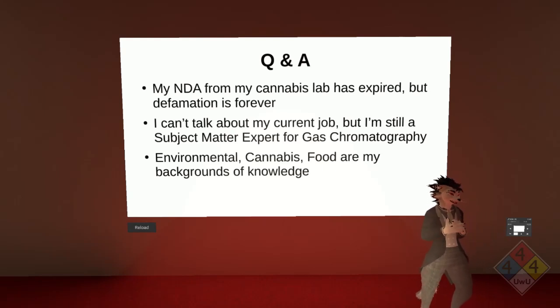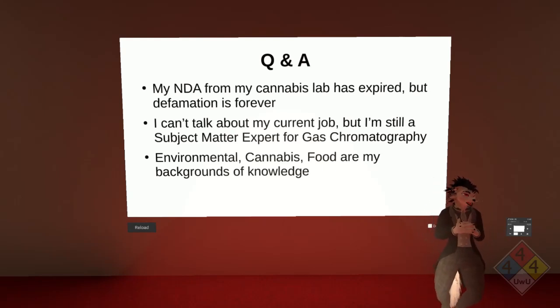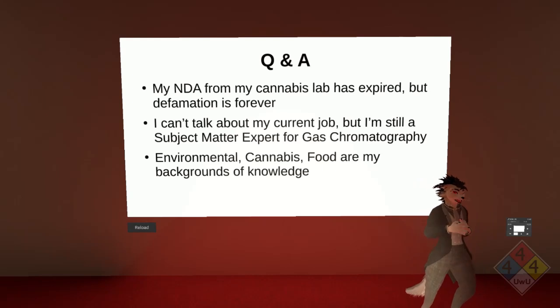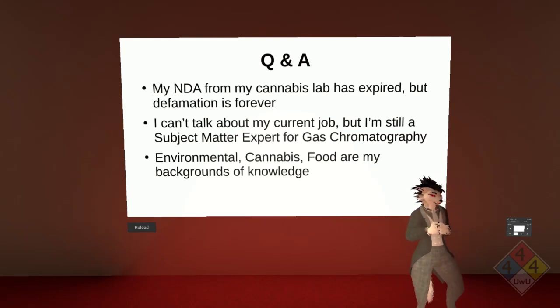But some of it's also down to the sensitivity limits, because NIR or some other types of spectroscopy could get a sort of accurate quantitation, but within the limits of like 0.3%, it makes those sort of systems difficult to use. So then you have to use a lot more expensive systems. So if there was an adjustment of these levels for instrumentation's sake, that would be great.